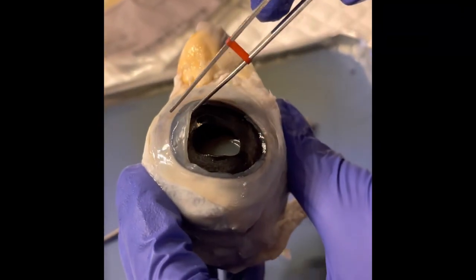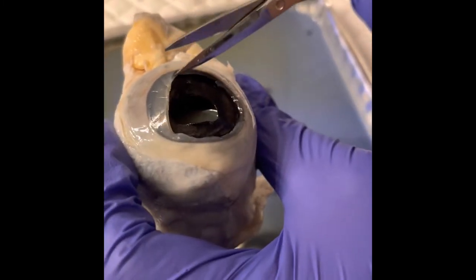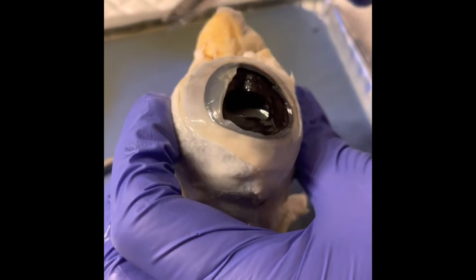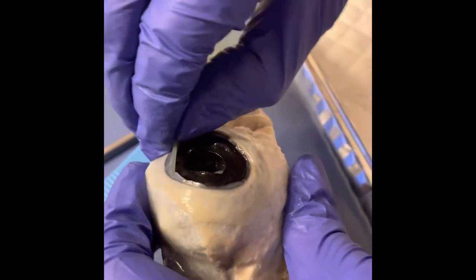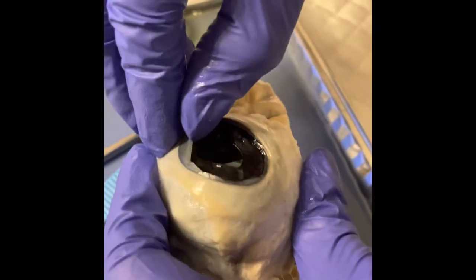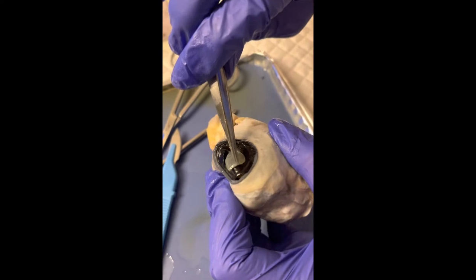Now, speaking in terms of the iris, that is actually a muscle, which helps the eyeball constrict and or dilate. It can help the cow's eye open and close, allowing specific amounts of light to come in. The pupil shrinks in the light and gets much bigger in the dark.